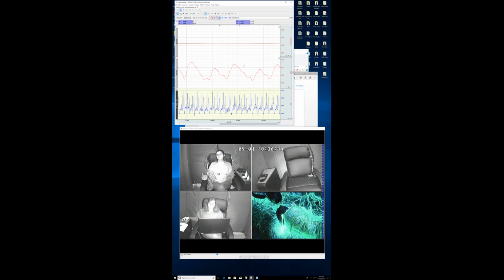He said perfect, thank you very much. And one last question, which you already covered briefly, is how to import, or is it possible to import the Observer data, the facial behavior, facial expression data into AcqKnowledge? And I know it is possible. So any other closing comments about that? No. Oh, hang on.